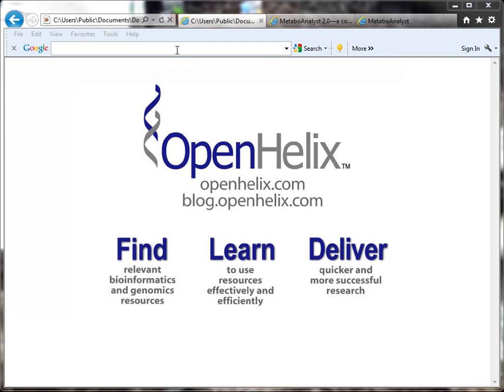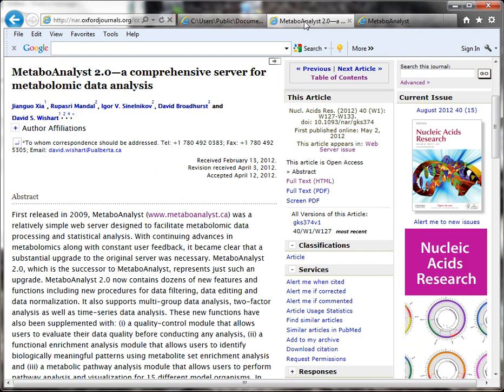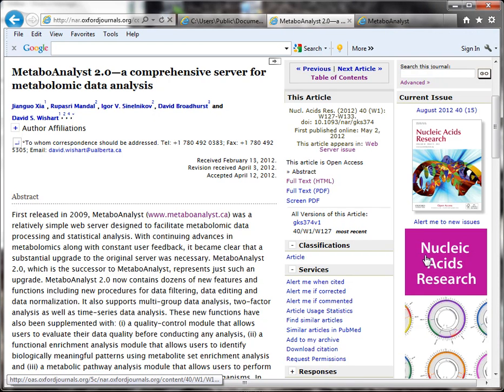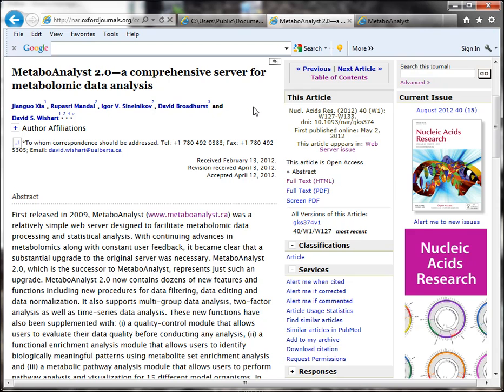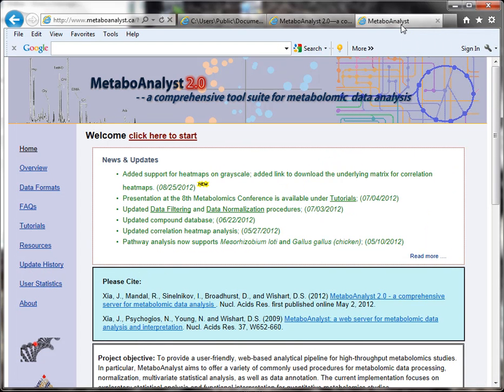In today's tip, I'm going to feature a resource that I found in the Nucleic Acids Research web server issue, as I explain in the post. The resource I'm featuring is called MetaboAnalyst 2. You can read this paper if you want to—I link to it in my blog post. We'll go over to the resource itself.